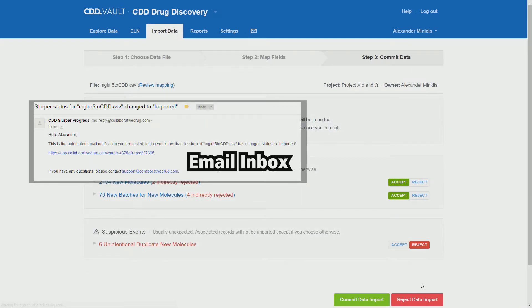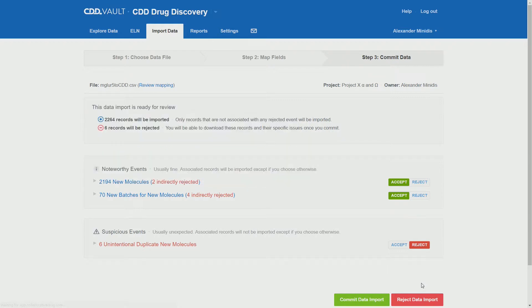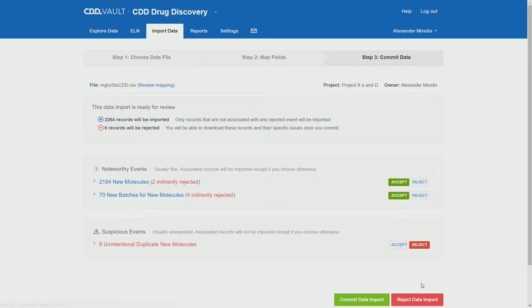With the email activated, you might have ended up having an email such as this in your inbox. In this case we have some unintentional duplicates, but knowing our import file well enough, we can go ahead and accept these unintentional duplicate molecules and do the commit data import.